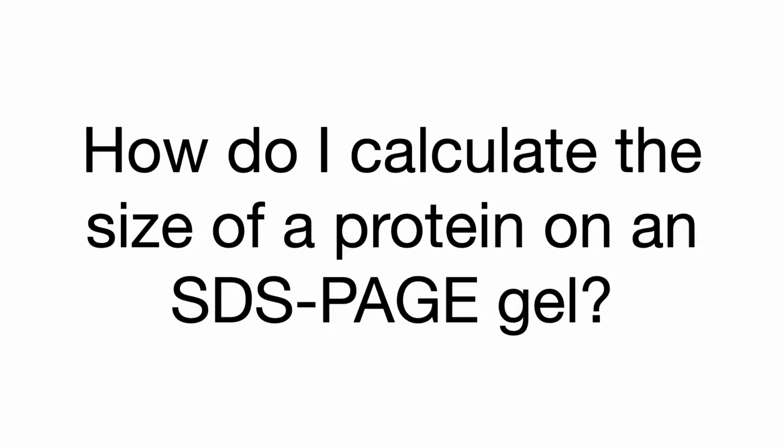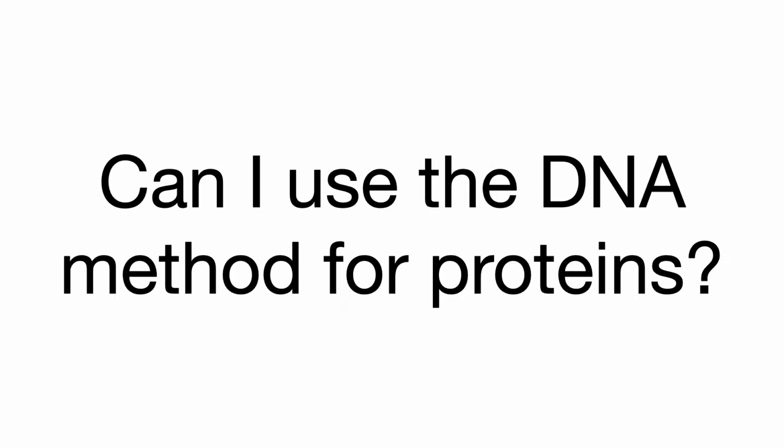This video is in response to two questions that I received. The first was, how do I calculate the size of a protein on an SDS-PAGE gel? And the second question was, can I use the DNA method for proteins?